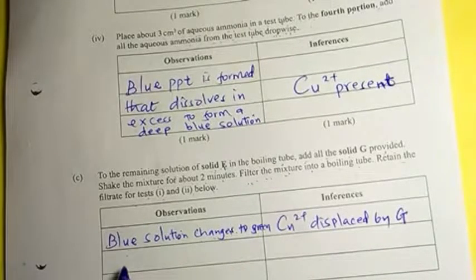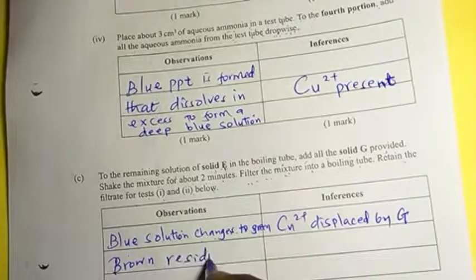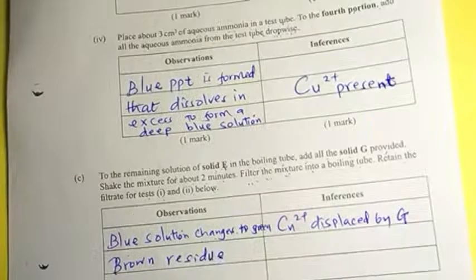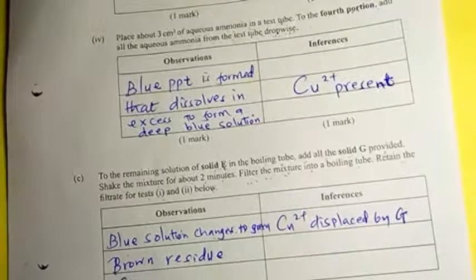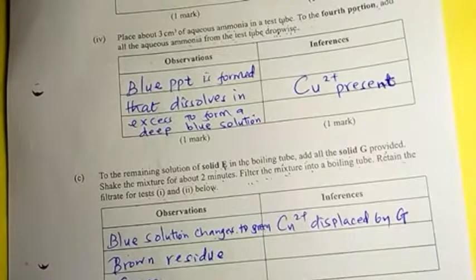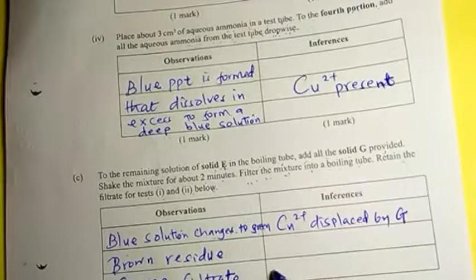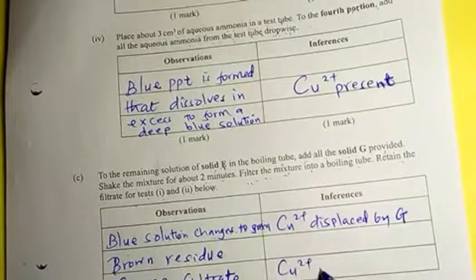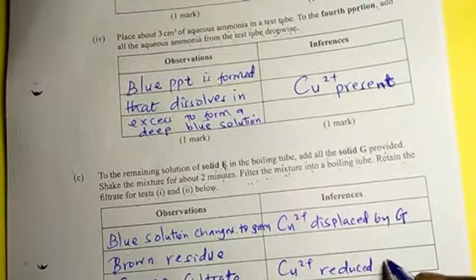Then a brown residue is formed, or remains. Then another thing is that after filtration, we have a green filtrate. A green filtrate. And then you can also add that Cu2 positive is reduced by G.